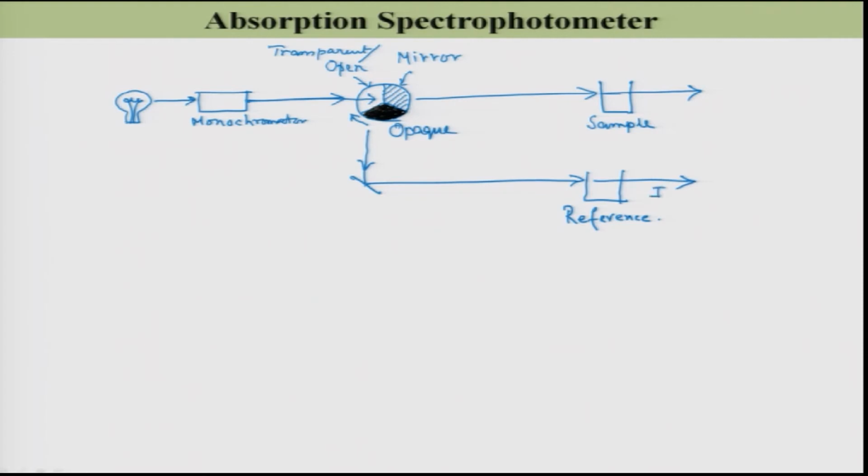So, this is my I0 and this is my I. Now, I have to combine these two somehow so that I and I0 are detected in the same detector, because there was a detector problem I mentioned. So, now you use another mirror over here somehow. So, this is also a mirror, let me write it for you, MIRROR.